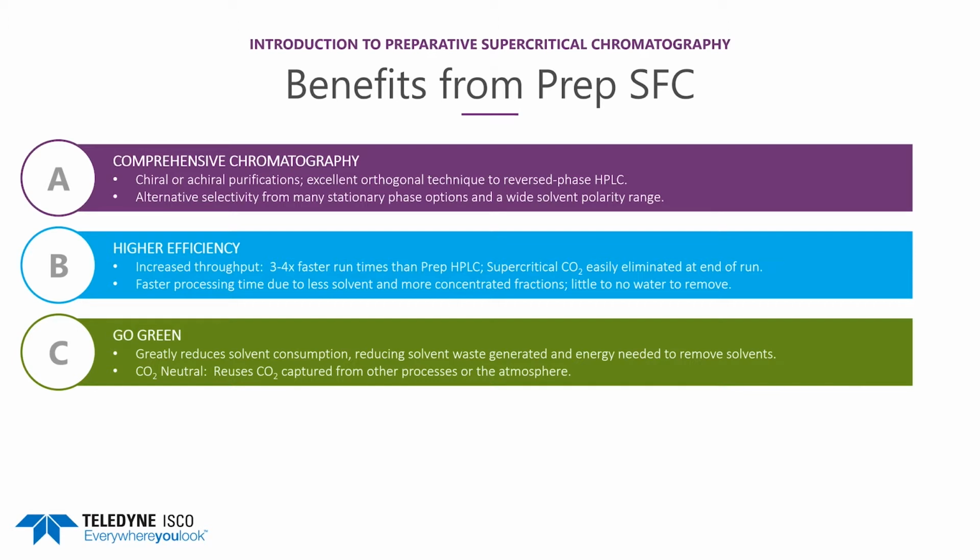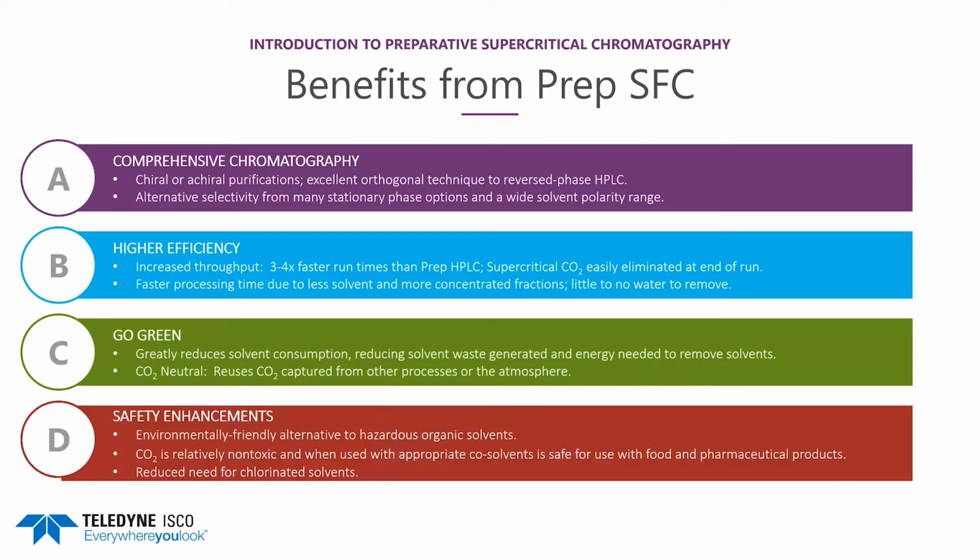SFC reuses carbon dioxide from other processes. There is greatly reduced need for chlorinated solvents because of the pi bonds in carbon dioxide. SFC uses carbon dioxide, which is relatively benign unless you get a huge gas leak. So you work in a ventilated area.